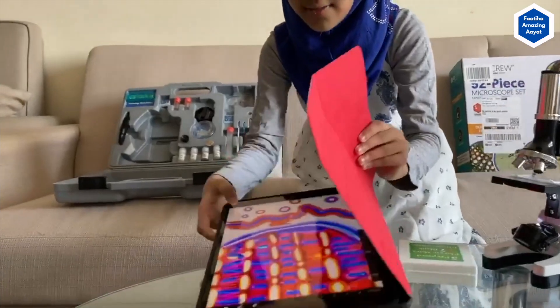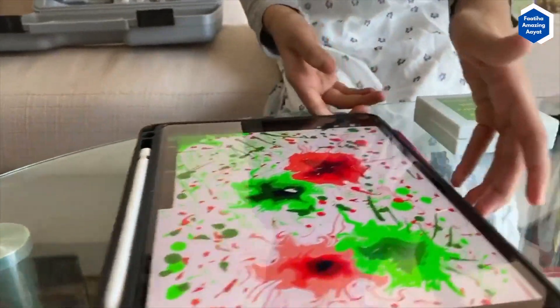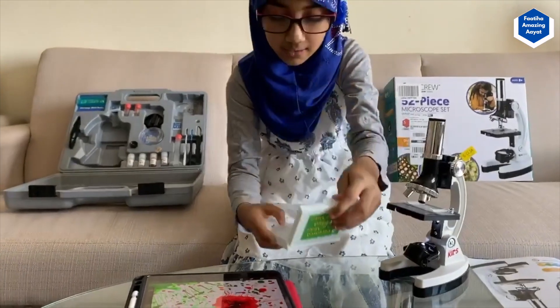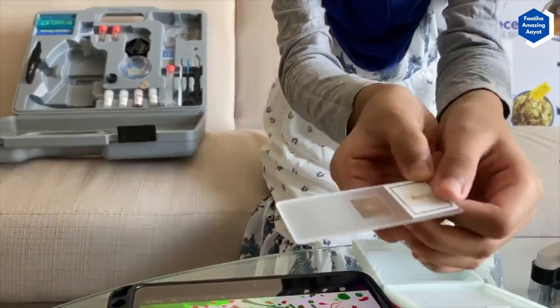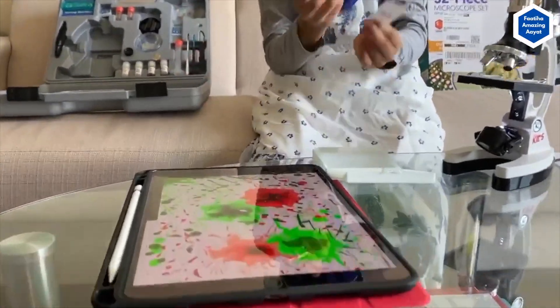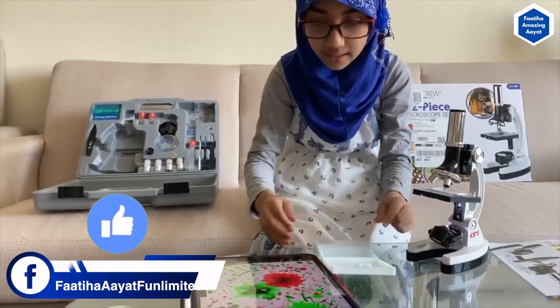Now I'm going to show you some things I have seen. This right here is very small — very, very small pieces of apple. This is how you see it when you use the microscopic view. They gave us a slide and if you actually see it, it is this tiny. But when we see it through the microscope it is so big that we can see it really close up. This is a 200-times larger picture of apple.